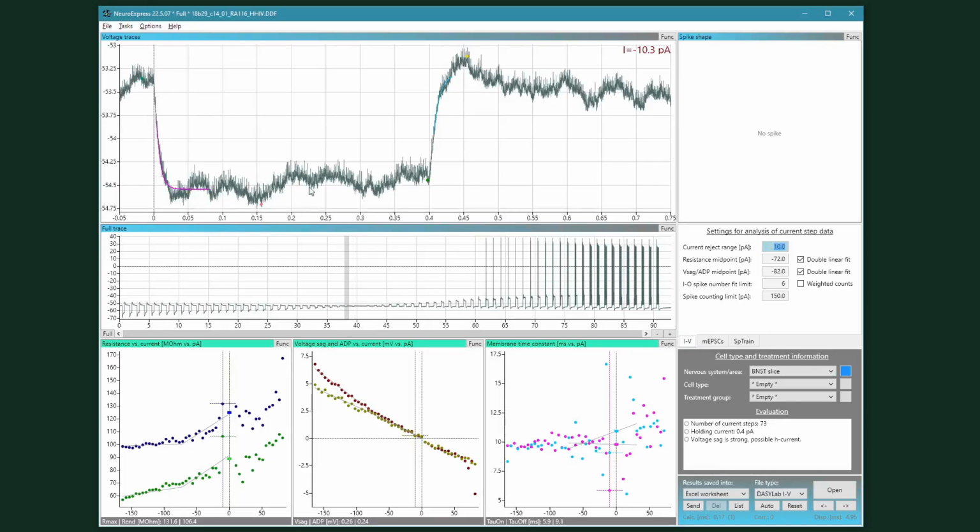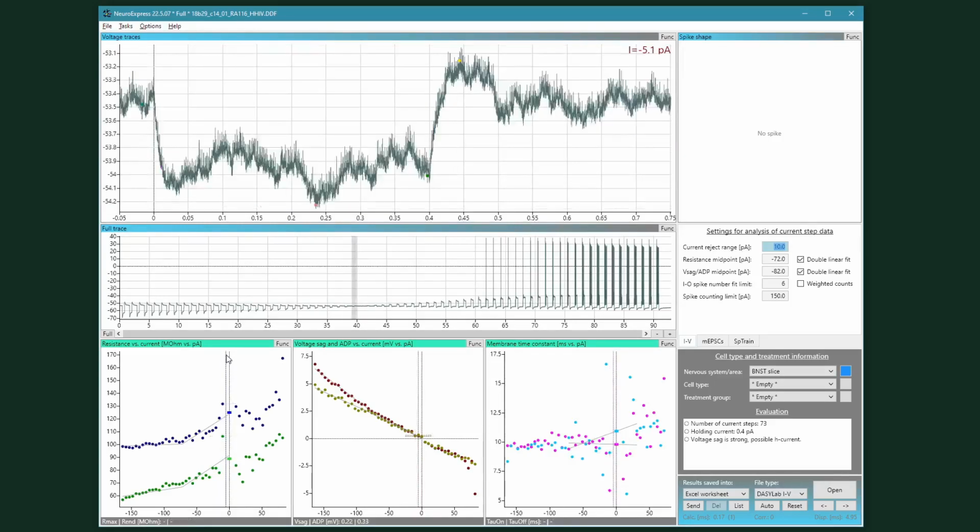Unfortunately, the membrane is never really smooth, and the membrane potential is never really perfect. There are sometimes EPSPs riding on top of the trace, or maybe some intrinsic membrane fluctuations or intrinsic noise that contaminates this. As a result, the noise can change the observed maximum voltage deflection by a few millivolts, or maybe just less than 1 millivolt, but the contribution of the noise to the calculated membrane resistance becomes stronger and stronger. That is very much true close to I equals 0.